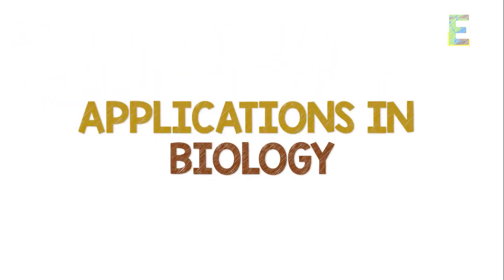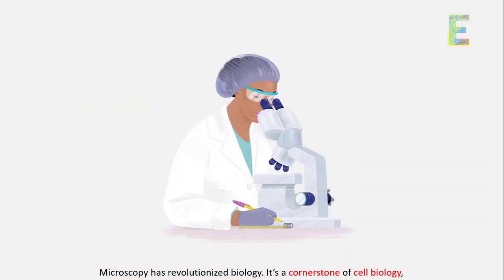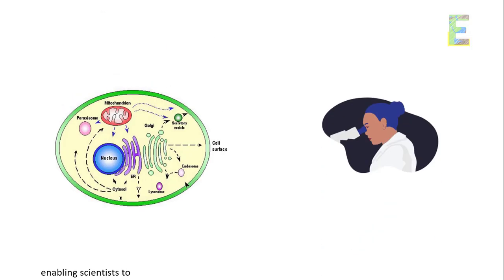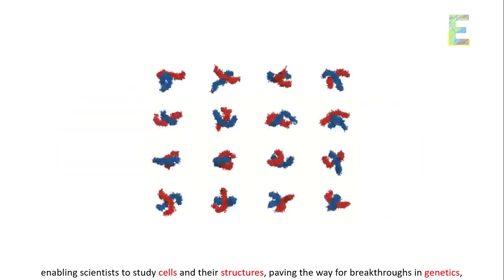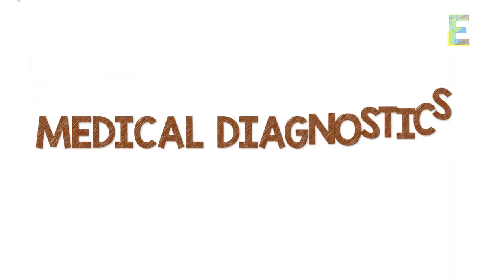Applications in biology. Microscopy has revolutionized biology. It's a cornerstone of cell biology, enabling scientists to study cells and their structures, paving the way for breakthroughs in genetics, microbiology, and more.